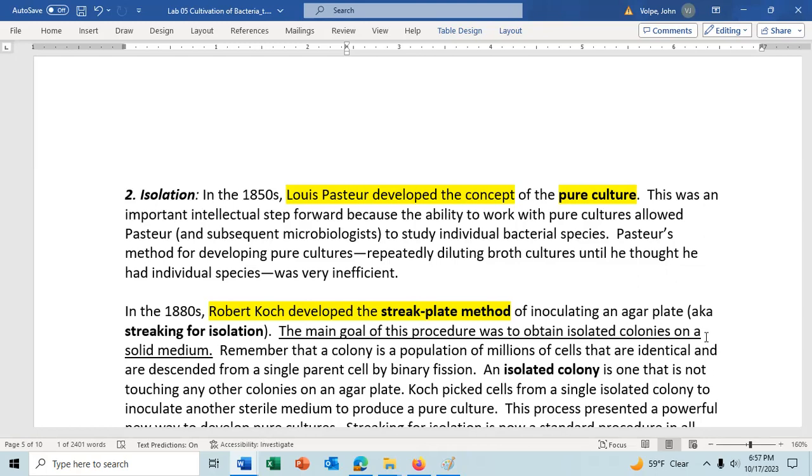In microbiology, if you streak it out 1 time on 1 plate, about 70% of the colonies will be formed from 1 cell. And so they will be about 70% pure. But that means 30% of the colonies are formed from 2 or more cells. And it could be a clump of cells, in which case they may not be pure.